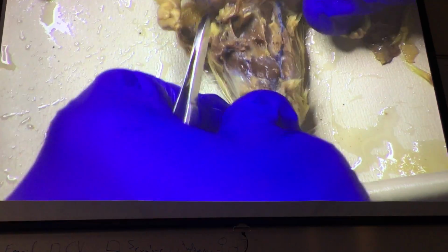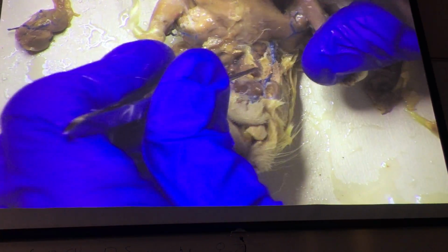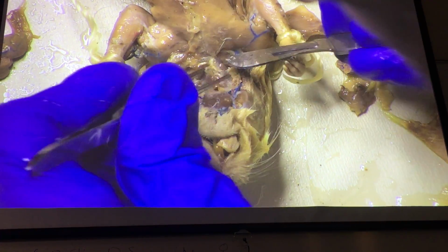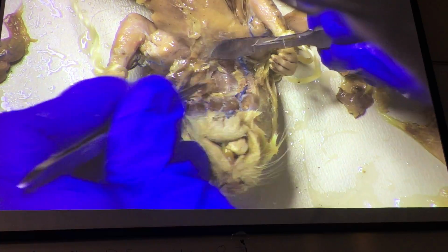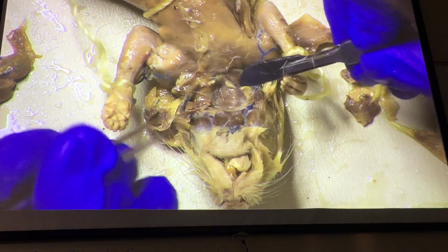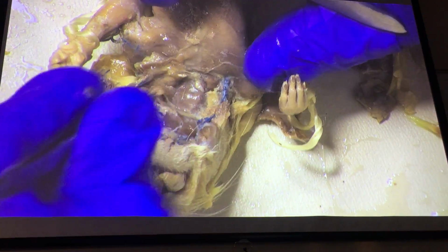Okay, we can begin to see some things in here. It looks like the neck was damaged on the muscles when they opened it up. Let's just make sure about that. It happens sometimes. I think actually it might be okay. No, it's all right. So right here, this little rat is all twisted as if it's never been crucified.